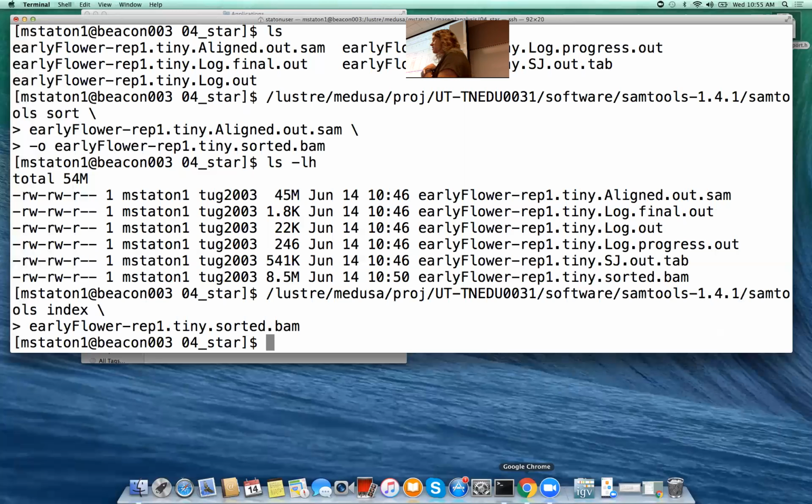Okay, so this is a good example of how RNA-seq reads are mapping to the genome. If this is your gene model, and the big blocks are exons and the little blocks are introns, you can see each of your individual reads is mapping between exons. So you see these bars, which means there's a gap. So it's mapping across the intron. Here's another one. There is probably an unannotated exon right here.